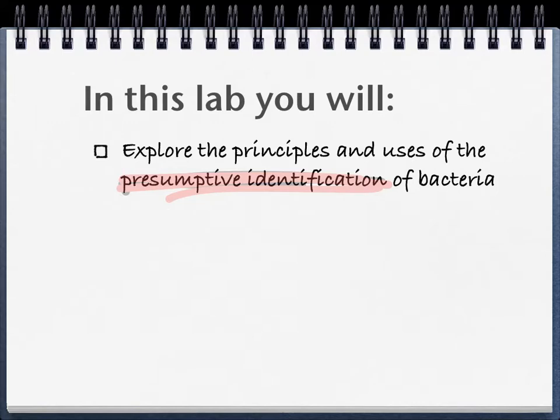Now, we talked earlier about a way to identify bacteria. What do we use to identify bacteria? How do we identify? Phenotypes, right? Good. So do you guys remember how we looked at phenotypes of bacteria? What we did exactly? Many ways to do this. Sure, staining is one, right? Staining gives you limited information, by the way. Gram-positive, gram-negative. Some kind of rod, some kind of coccus, right? So it gives you better, but limited, right?